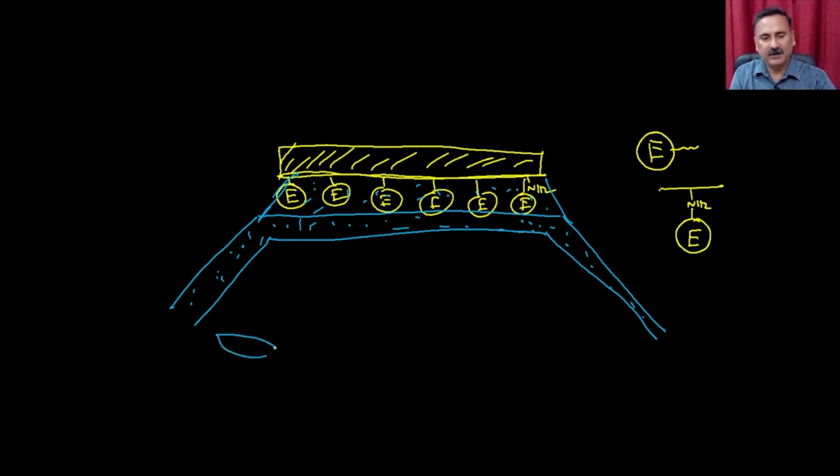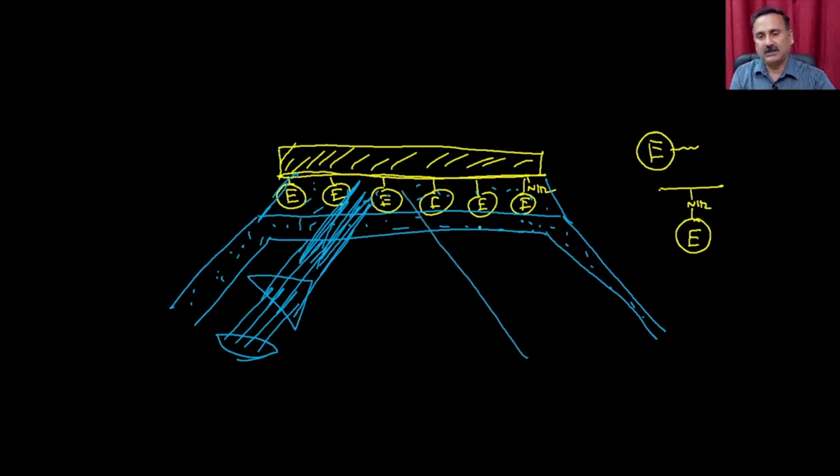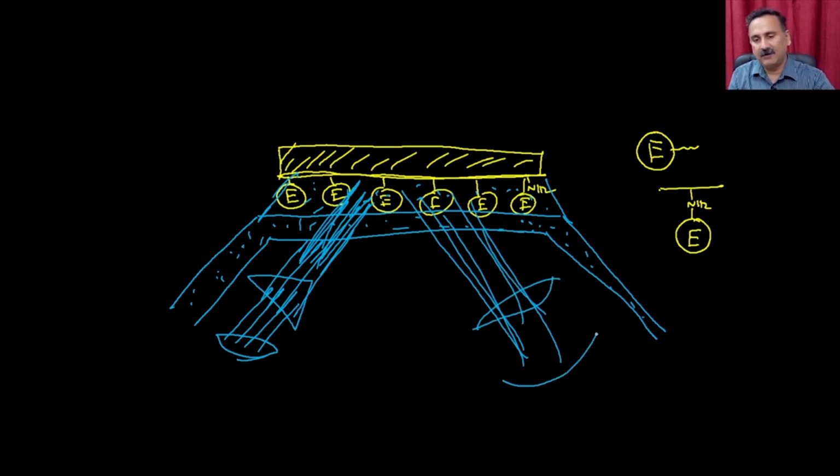So I can have a light source here. Then we can have the prism so that I can illuminate the sample with this particular wavelength. And then I can also collect the wavelengths like this, and on this side I can have a detector. So this is the detector that we have, and this is the microfluidic chamber.